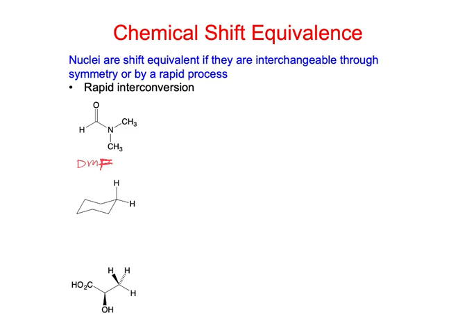Do you know what the NMR spectrum looks like? It depends on the temperature, right? Because it's an amide bond. But no, I don't, because I completely remove all of the DMF when I run an NMR. But there are two different signals for the methyls, and then there's the aldehyde one, the formamide one. Yeah, but there are two distinct.